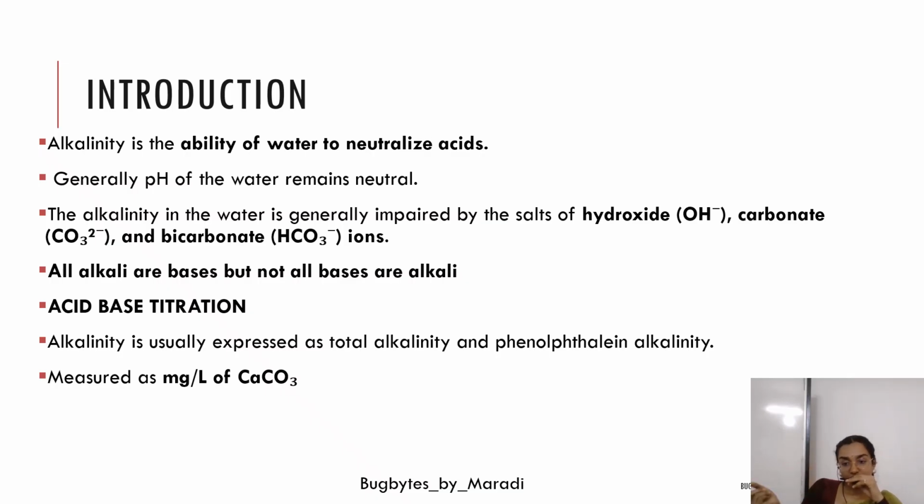Along with these carbonates, bicarbonates, and hydroxides, we have silicates, phosphates, borates, and many other ions. They also lead to the alkalinity of the water, but they are present in smaller quantities compared to hydroxides, carbonates, and bicarbonates. That's why we are not considering silicates, phosphates, borates, and other ions.